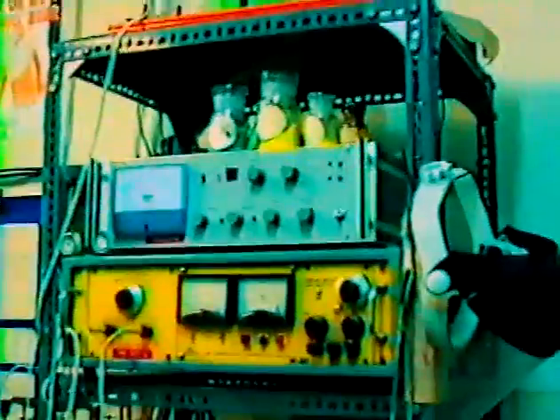British made, I guess it's nearly 20 years old, but it works. Probably you remember I showed a picture during my lecture, MS analysis of the gas phase during the decomposition of methyl chloride. It was done by Tamás in this system, so it's very useful data.